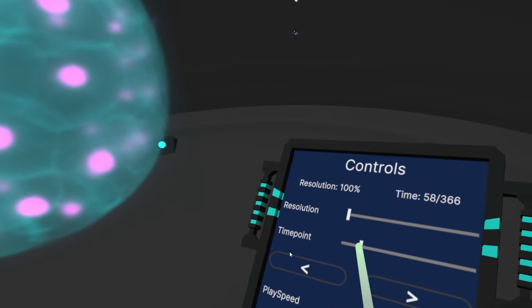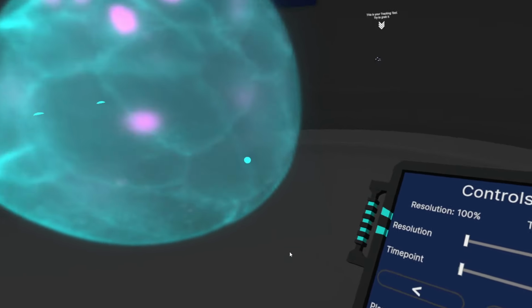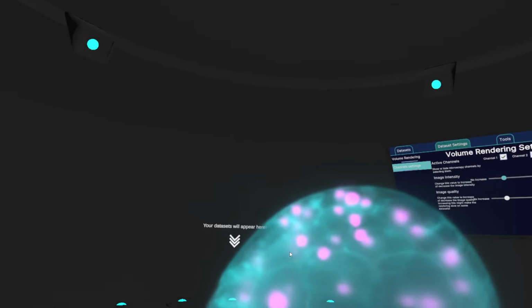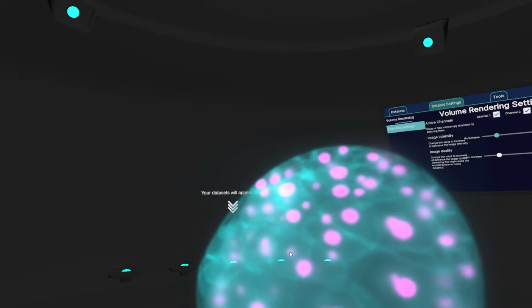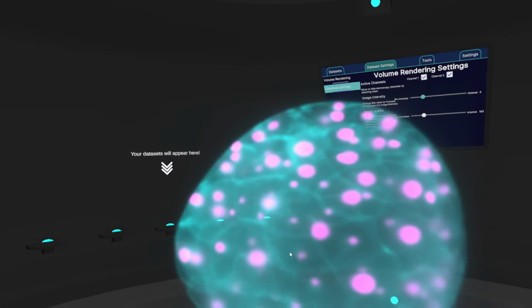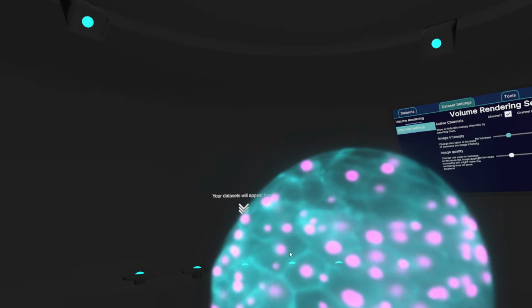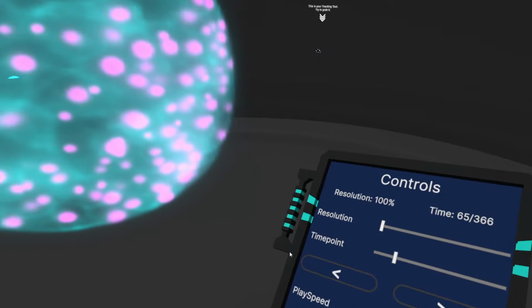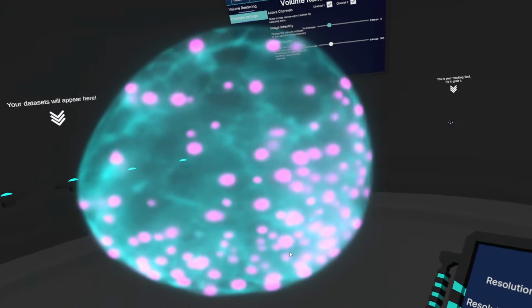But if I pause it, go back to the very beginning and click play, then the movie goes a bit faster because it has pre-cached the entire little slice of the data set that I've done here. And in a similar manner, if your computer is not powerful enough, it might not be able to pre-cache the entire data set. But if you have a good enough computer, this shouldn't be a particular problem.